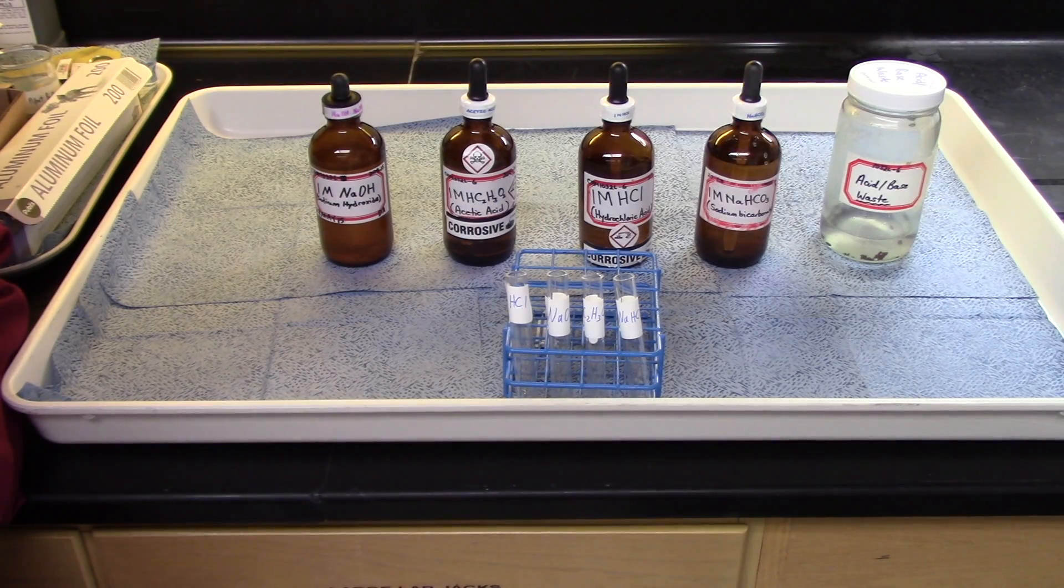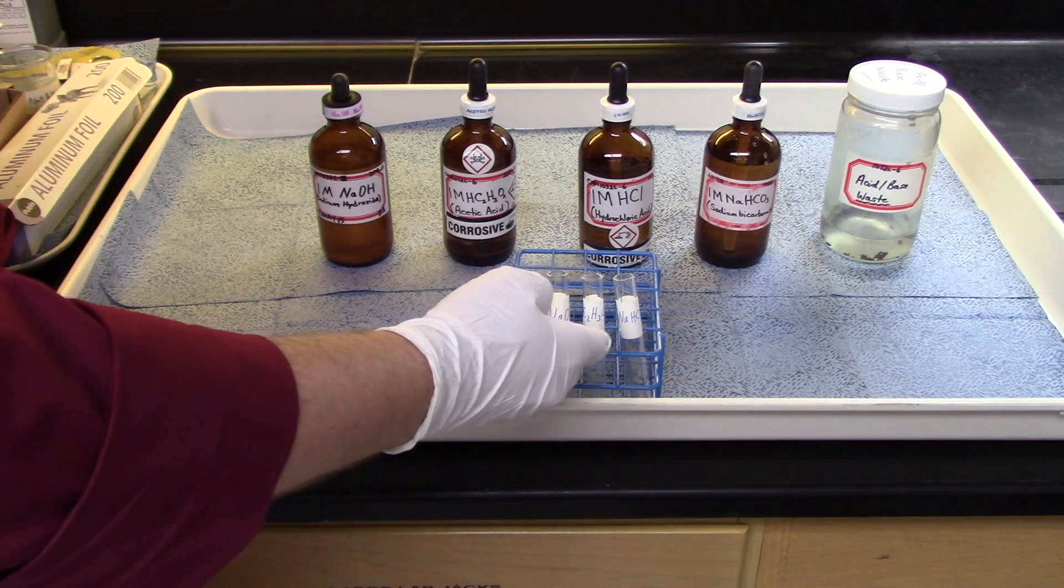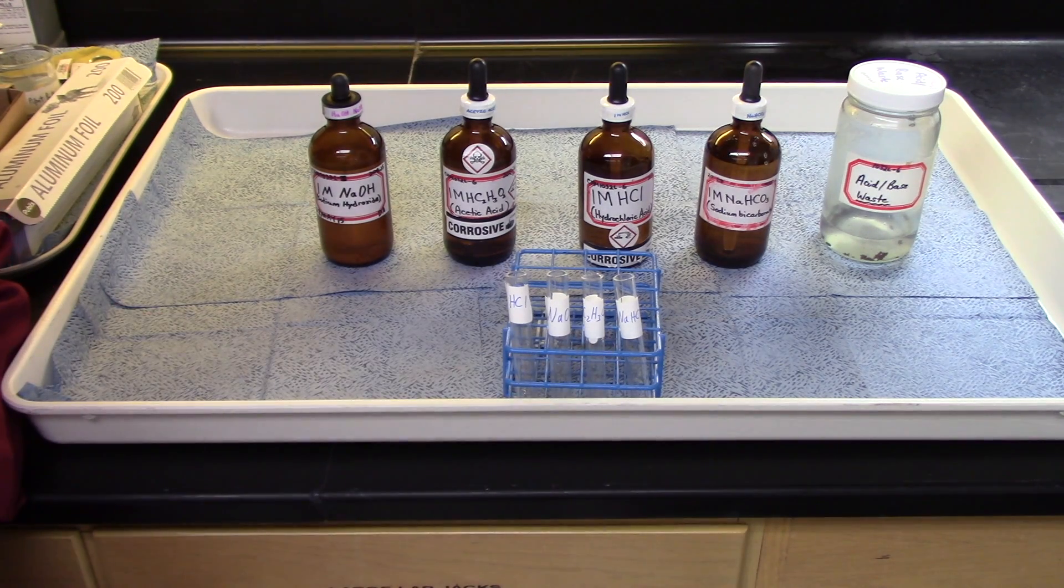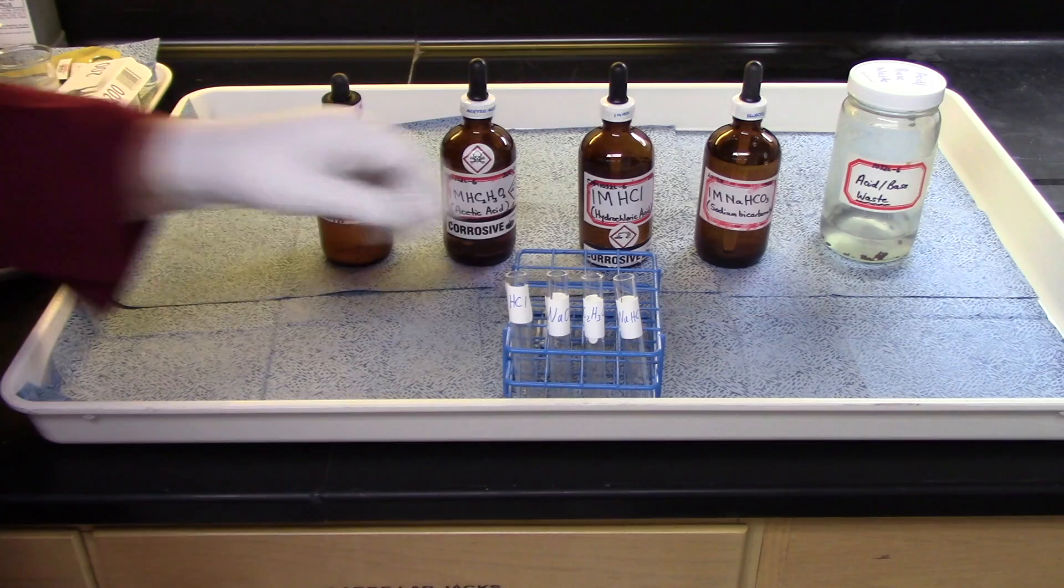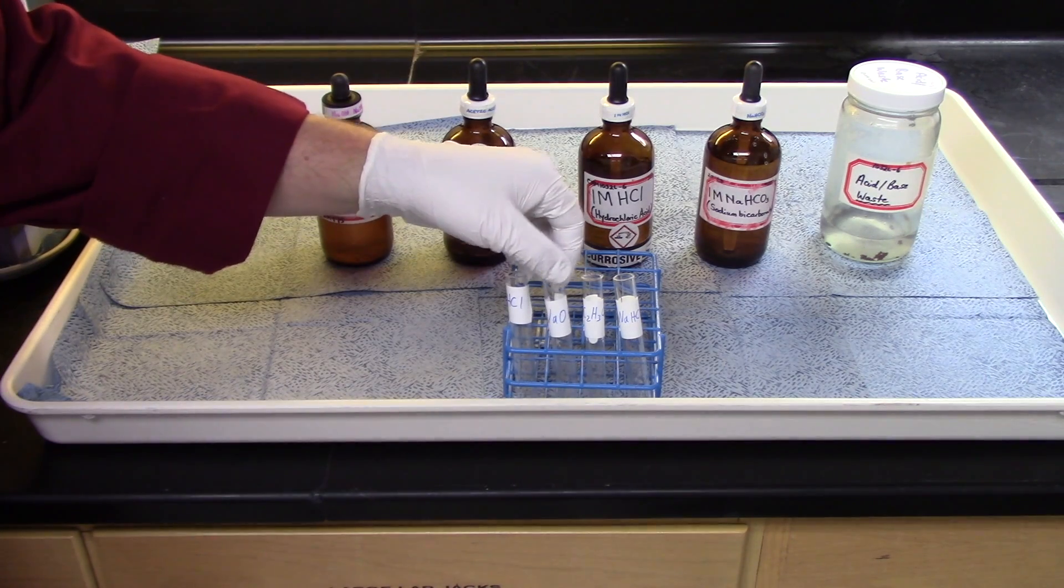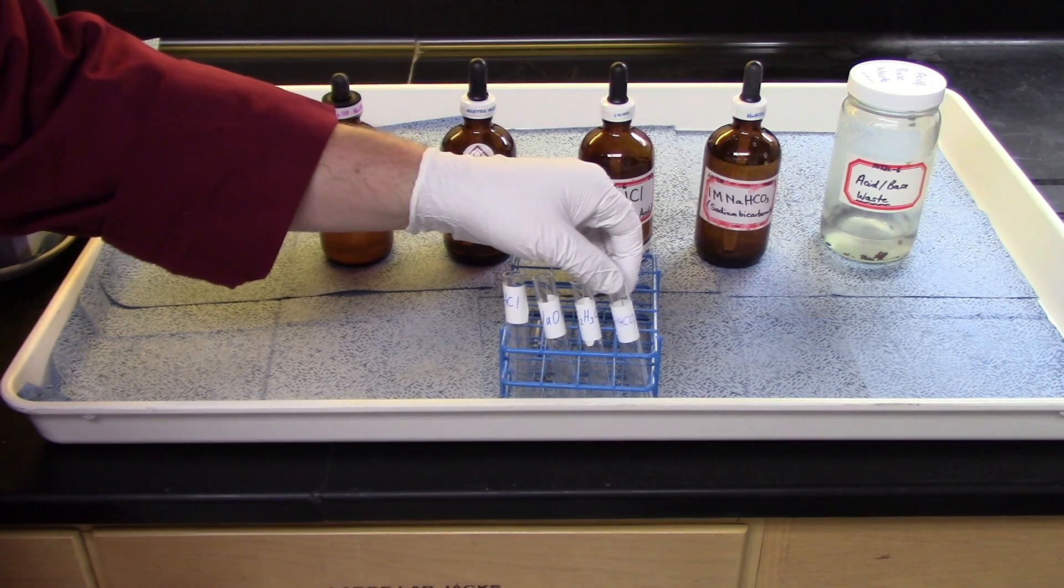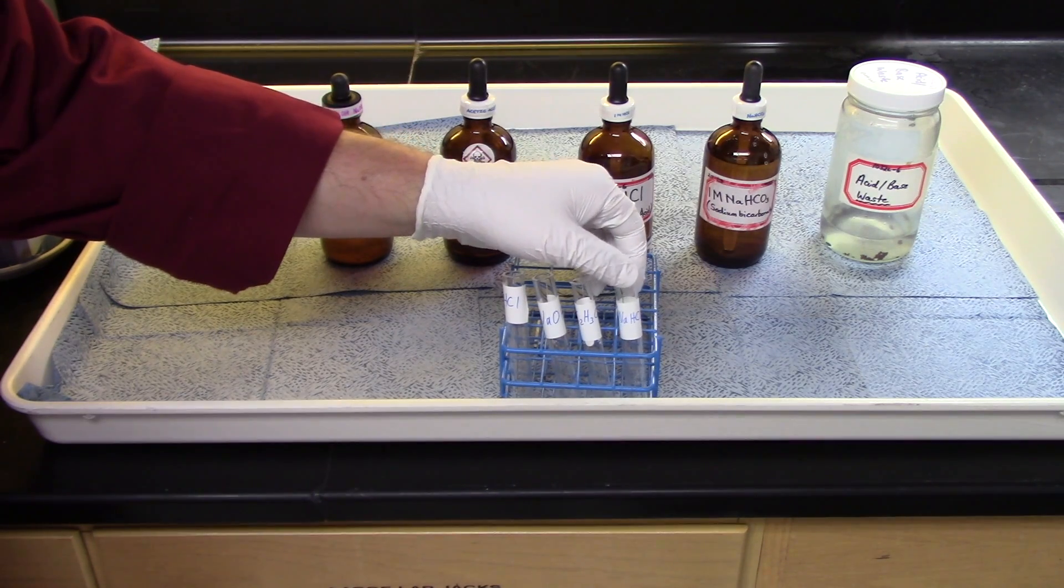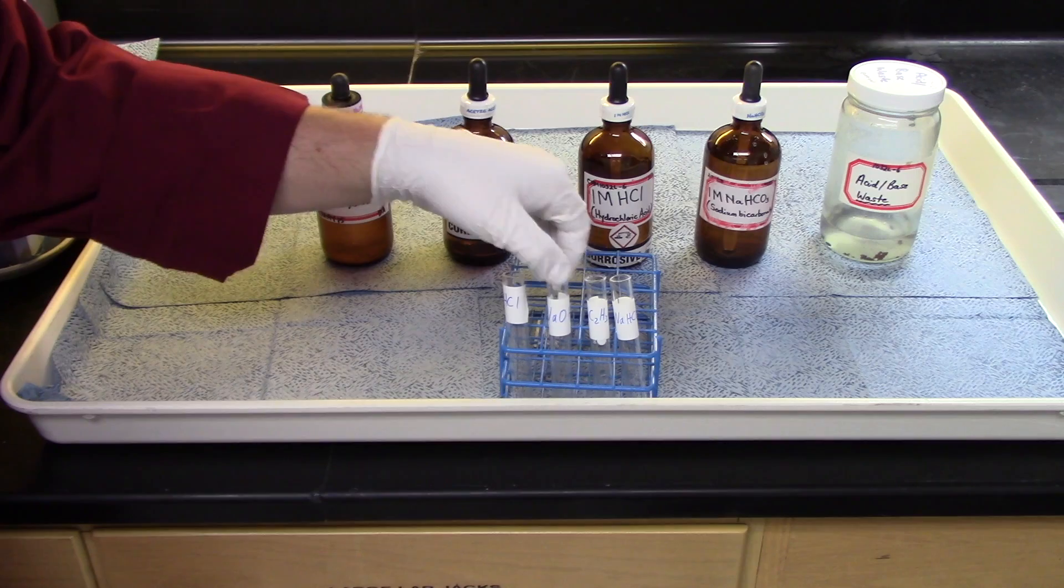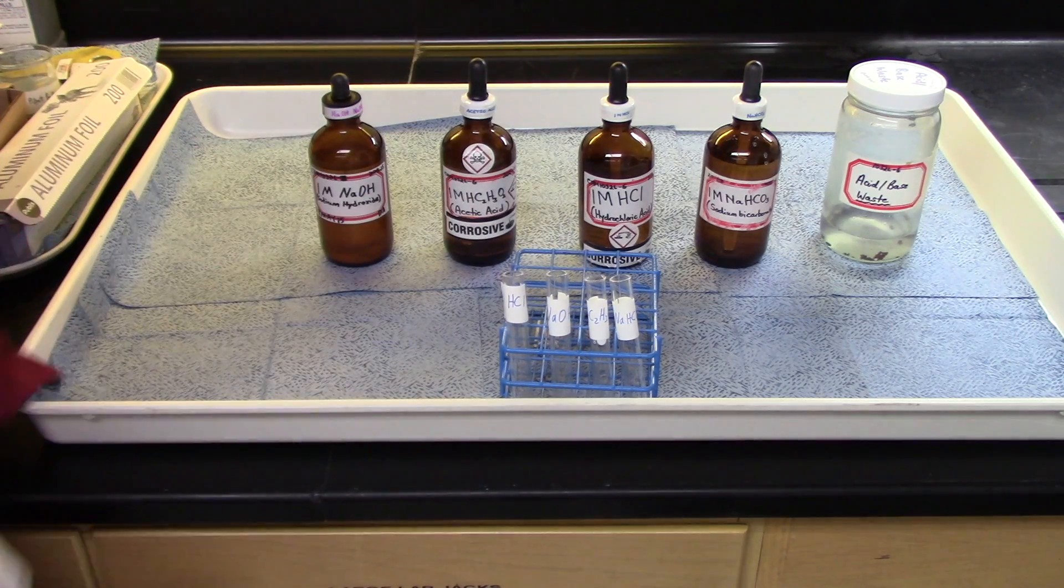This is part three of today's experiment. Again, I have labeled four different test tubes for four different reagents. HCl, NaOH, HC2H3O2, and NaHCO3. Make sure that the correct reagent goes into the properly labeled test tube.